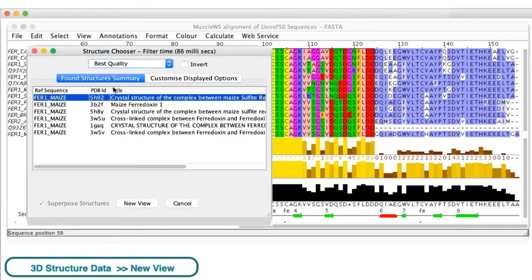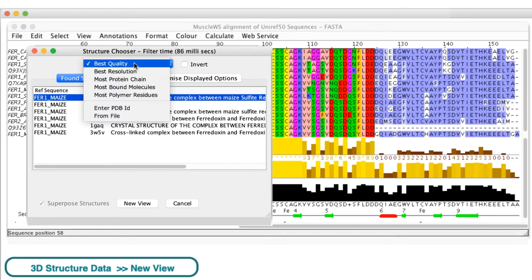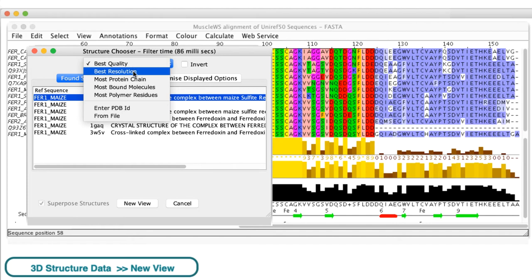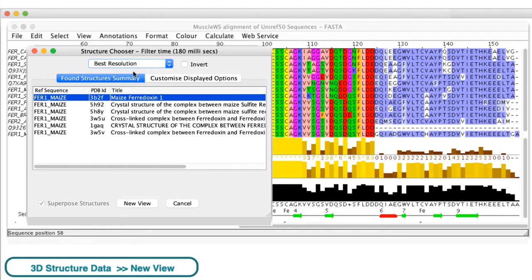In the structure chooser dialog box, the structures can be ranked. Best Quality is the default option, but there are several other options such as Highest Resolution. I select the structure I require and click View.